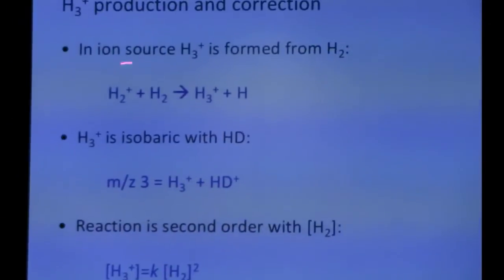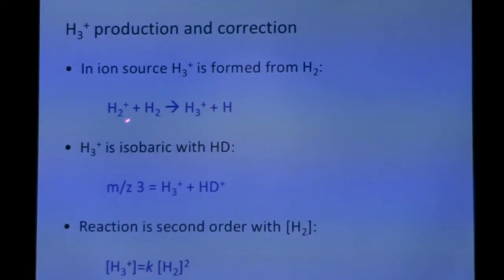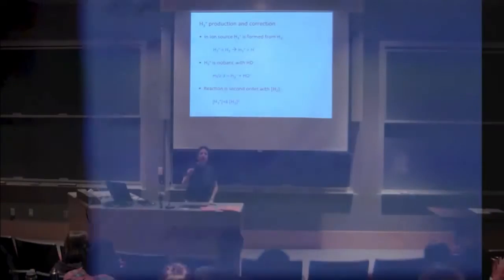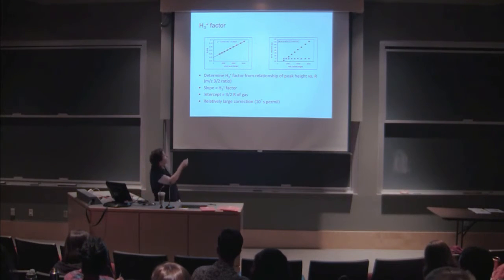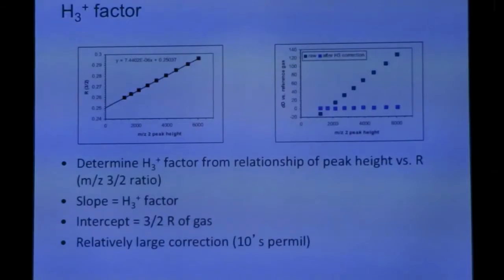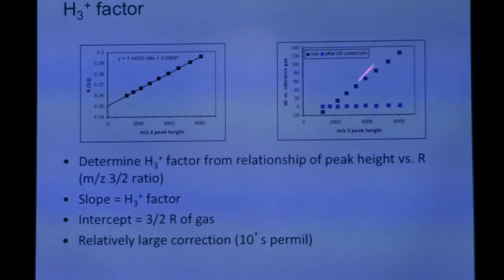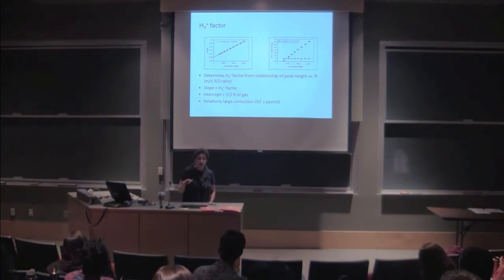So H3 factor is a correction for the fact that in ion sources where you have H2, you can actually have three hydrogen ions come together to make an H3 ion. And then production of that H3 ion scales with the amount of hydrogen H2 that you have in the ion source. So you just simply want to kind of create a regression between the production of H3 and the amount of hydrogen in there. And then once you have that regression, you can apply it to your samples. Here's that production reaction. You take hydrogen, diatomic hydrogen ion and react it with a neutral. And you can end up with an H3 ion and a neutral as a consequence. And that has an isobaric interference with your deuterium. And remember, deuterium is really, really small abundance in nature. And so even a little bit of this H3 ion can confound your measurement. And it scales with the amount.